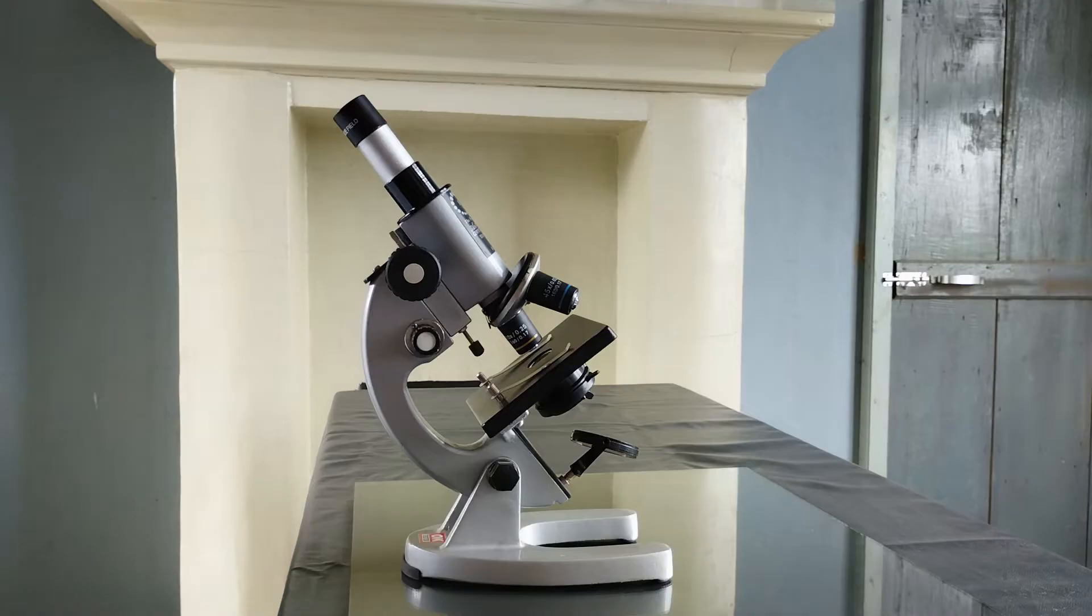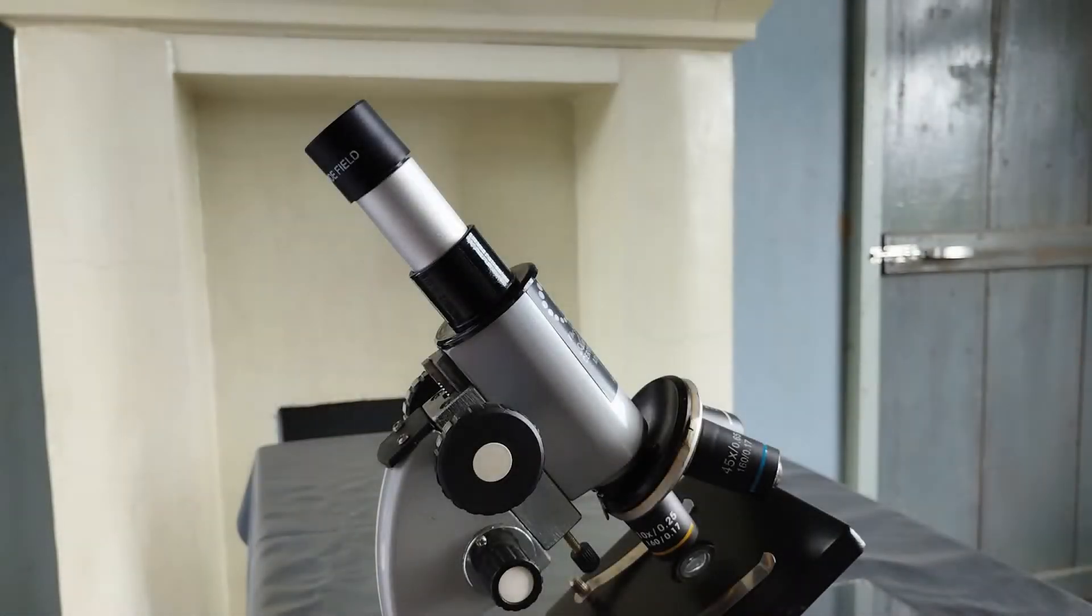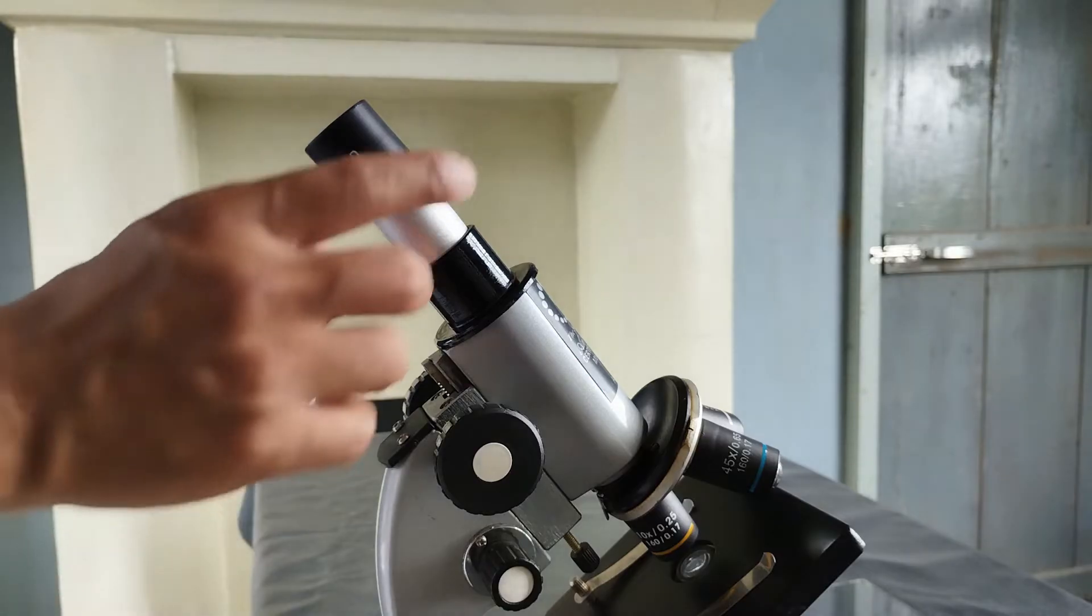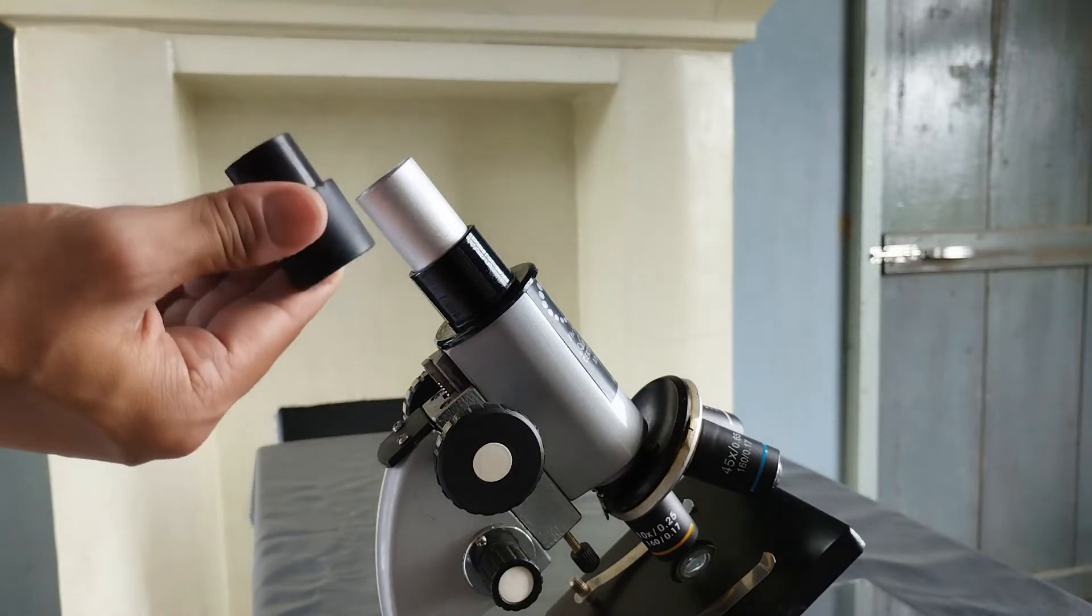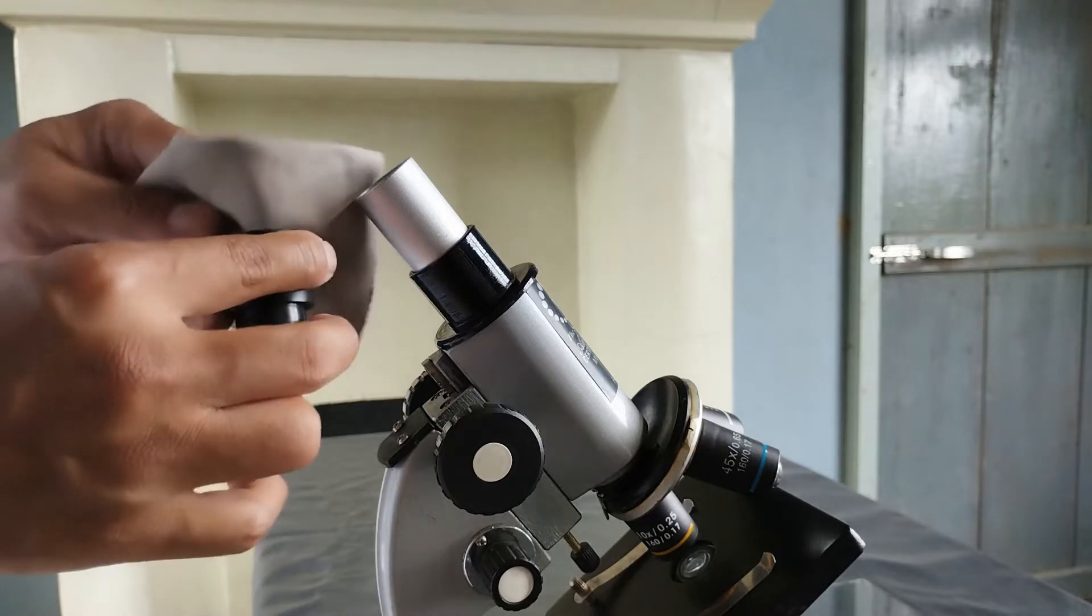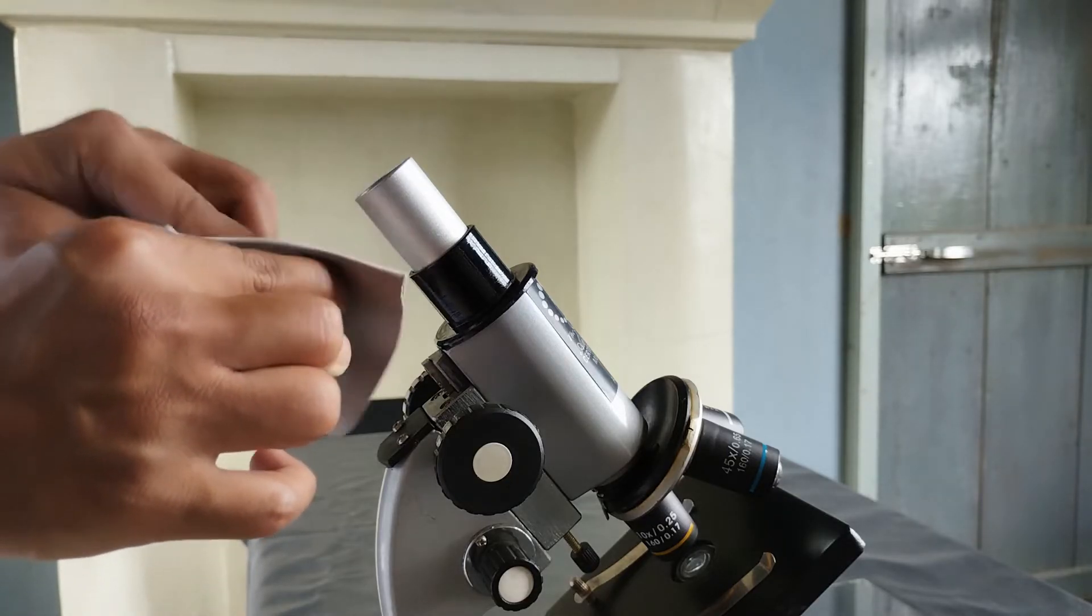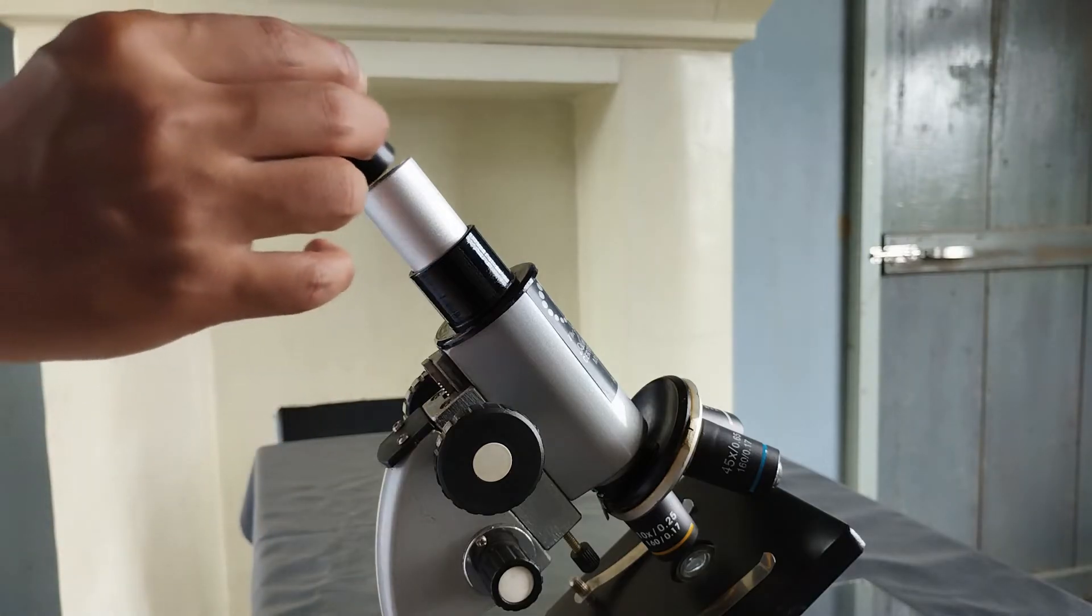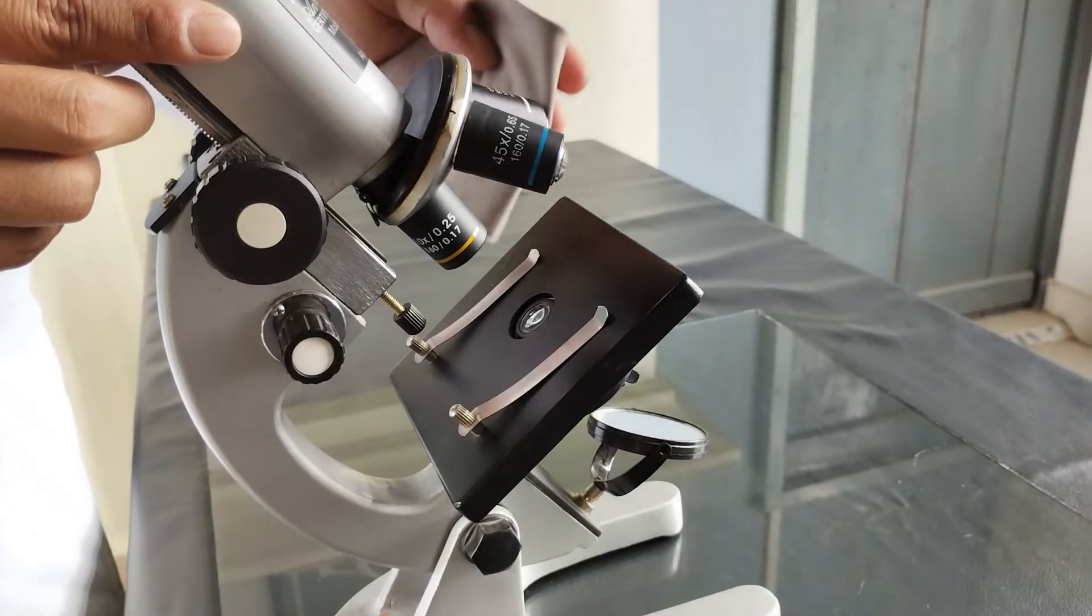Once the microscope is correctly positioned, the first thing you need to do is to check the eyepiece or ocular for dust and dirt. For this, remove the eyepiece from its position and check both the upper and lower lenses for dust and dirt. If present, use a lens cloth or lens paper to wipe it clean. Reinsert the eyepiece into the ocular tube once cleaned. Clean the external or front lenses of the objectives as well.